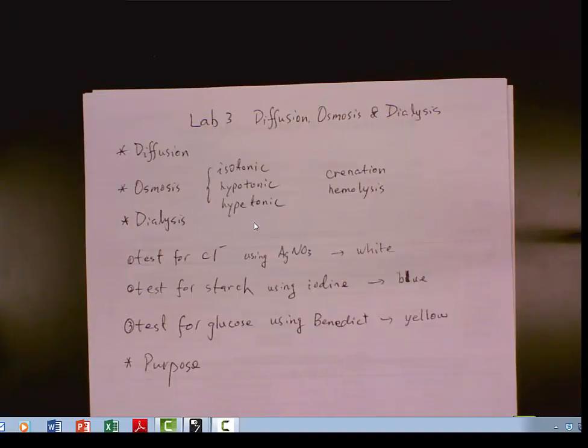This is Dr. Wu. I'm making this video for Lab 3, Diffusion, Osmosis, and Dialysis. This is a very interesting lab. First of all, we need to make sure those three concepts are clear.